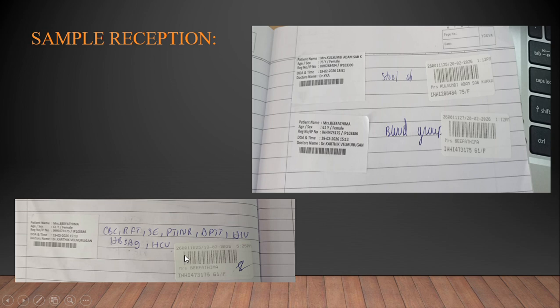So we put our barcode like this and we sign that such a sample has been received. This is very important because what happens is, most of the ICUs and other areas would have raised the request at 12 o'clock or 1 o'clock at night, but the samples are usually sent in the morning at 5 o'clock, 6 o'clock or 7 o'clock, in that range.